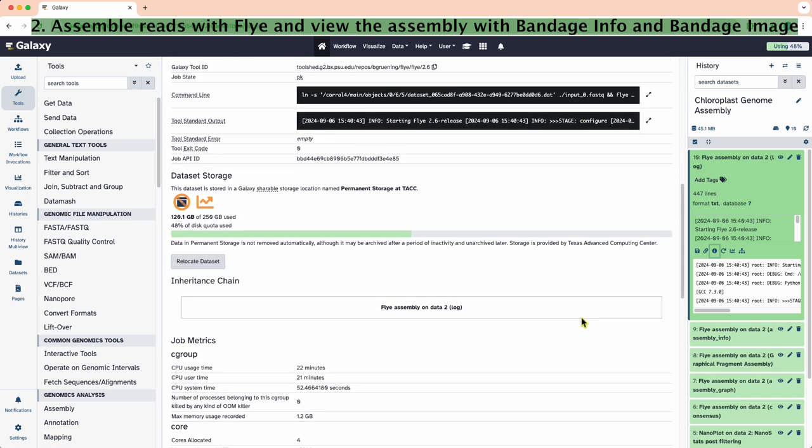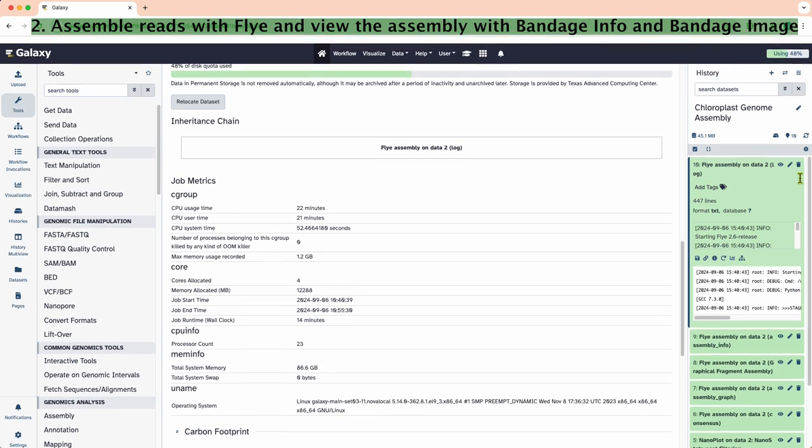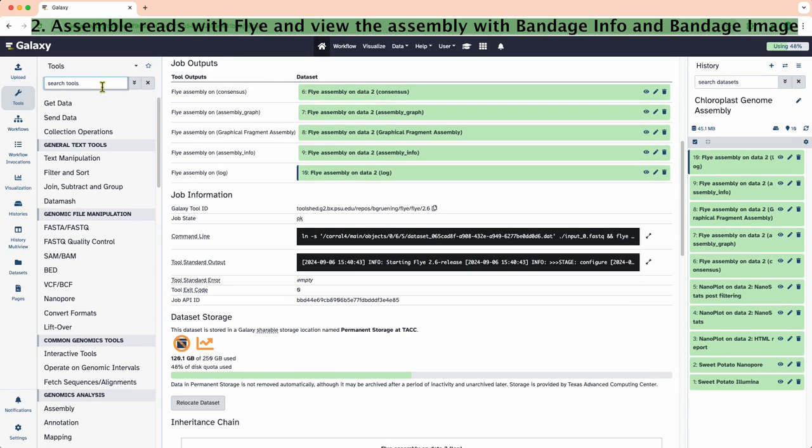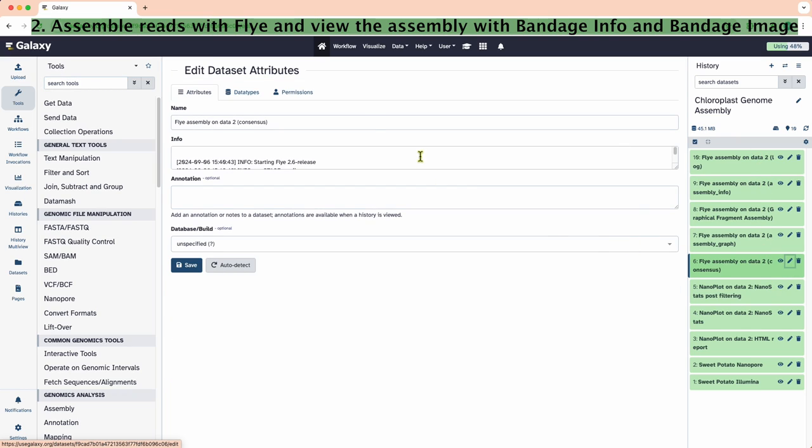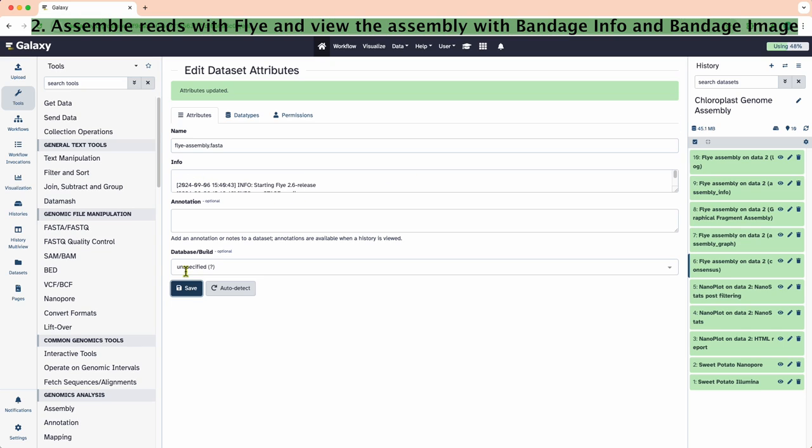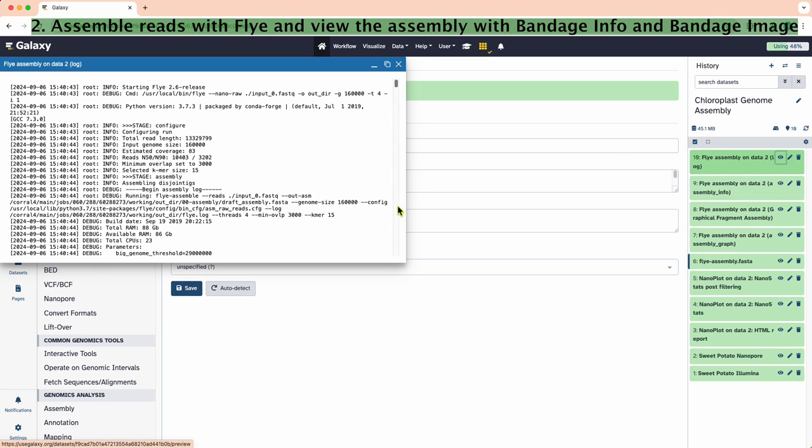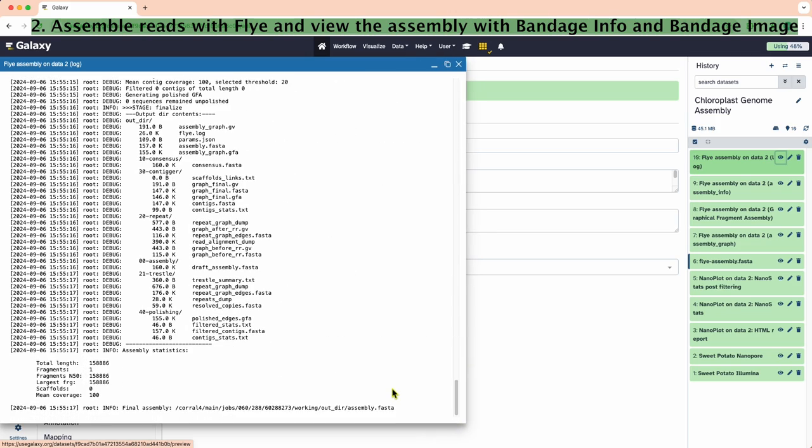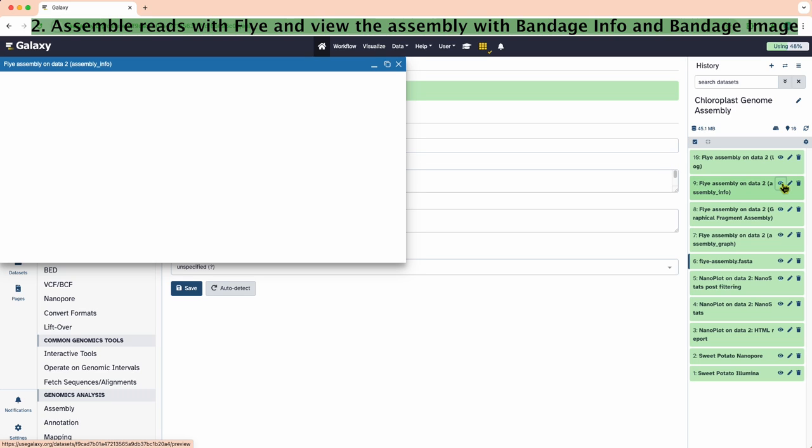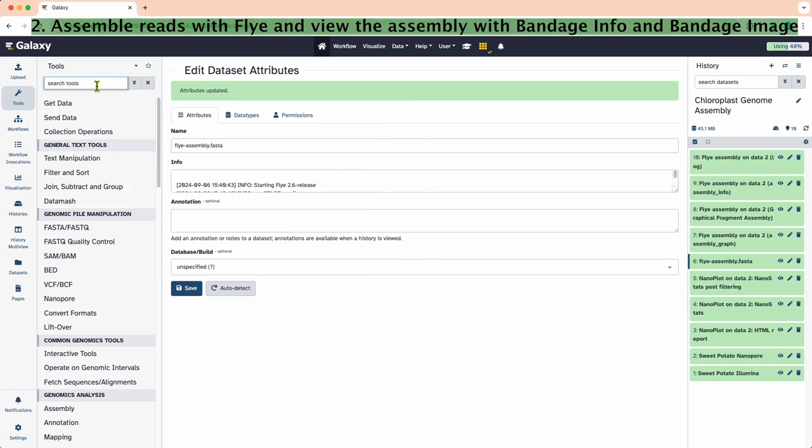We got 5 outputs after 14 minutes this time. Let's rename the Flye assembly on data to consensus as flyassembly.fasta. We can check how many contigs were assembled by looking at the log. We can also check the length of the contigs. In this particular case, we got one contig and the length of the contig is 158,886. The assembly info file contains individual contig names and lengths.